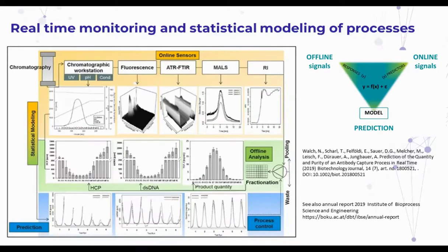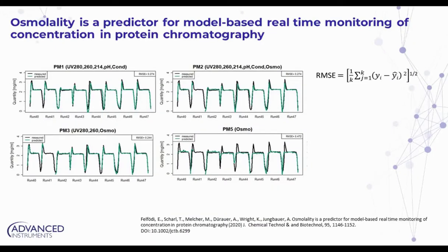So now, together with the company Advanced Instruments, we wanted to explore the effect of osmolality as a predictor for our real-time monitoring and statistical modeling.